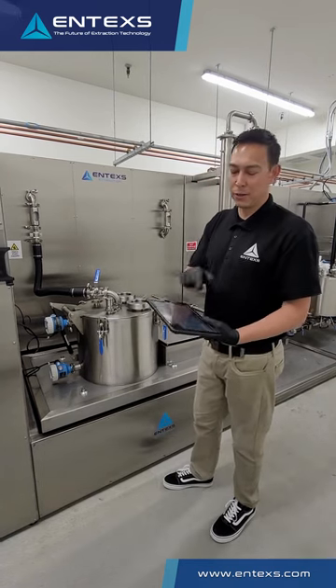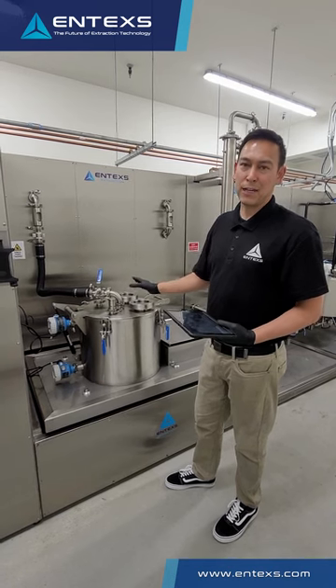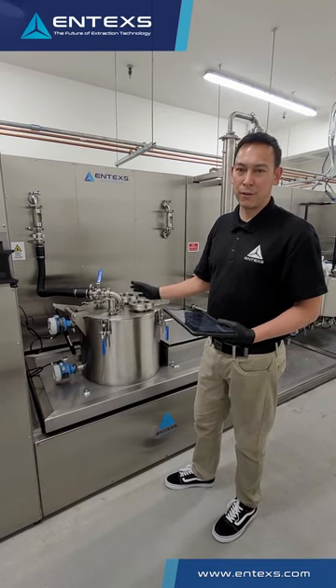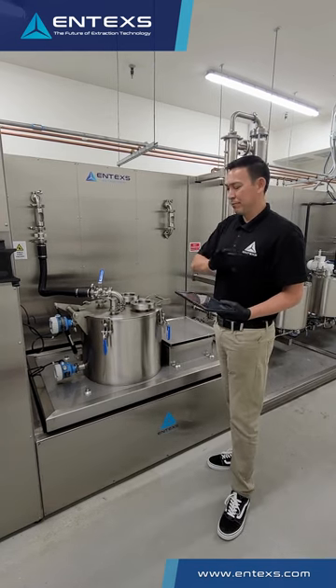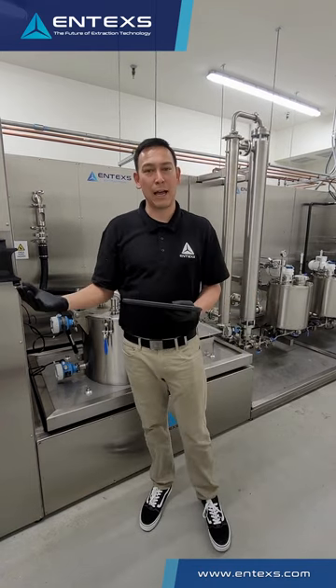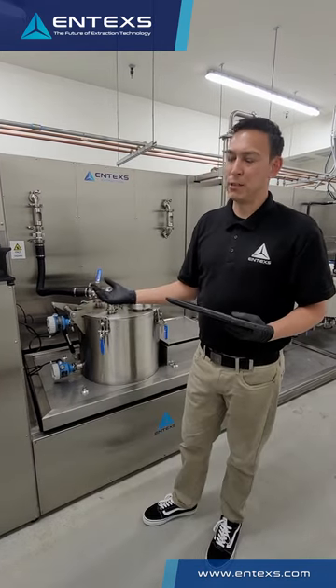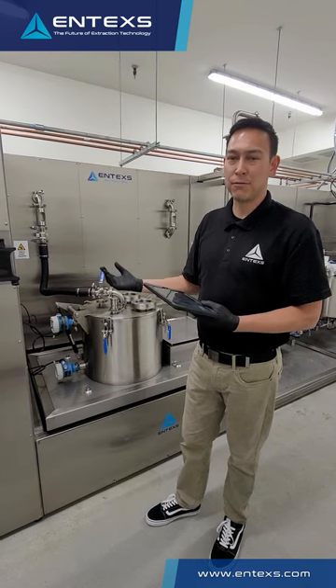From there everything runs in the background. You press start and all of that runs in the background. The total cycle time on this is typically 20 to 25 minutes from bag-in to bag-out, and from that standpoint you can be off doing other things, maintaining other pieces of the equipment and running the lab. It's a really nice piece of automation software that allows us to run it in this fashion.